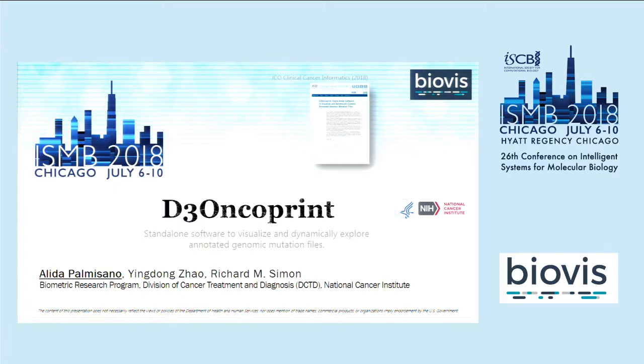Hello, as I said, I'm Alida Palmisano, and I'm a research fellow at the National Cancer Institute. In my branch, we develop software to support biomedical research in the area of personalized medicine. So what I'm going to present today is a tool that we recently developed called the D3Oncoprint, a standalone tool to visualize and dynamically explore annotated genomic mutation files.